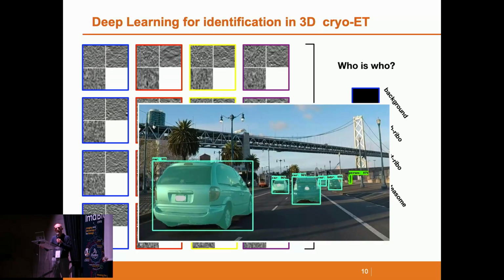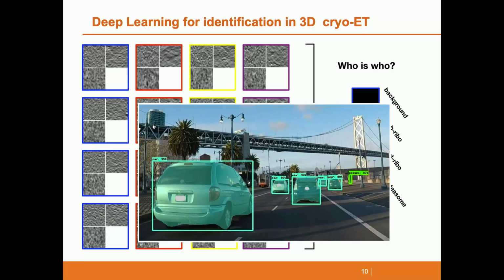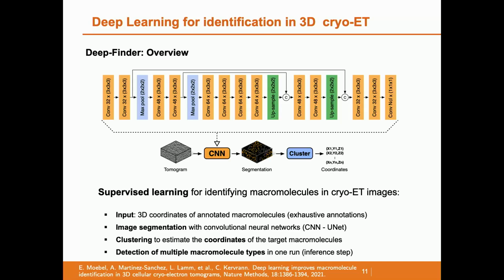So this is a challenge, right? That's why we have a collaboration with the Max Planck Institute, who supply annotations collected from a campaign of maybe 6 years of annotation. Actually, the PhD students labeled and annotated different macromolecules and collected data sets, which became in the future a training data set for us.